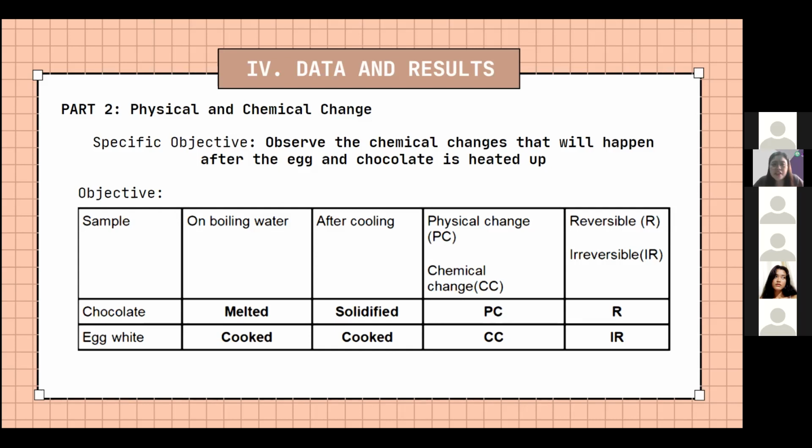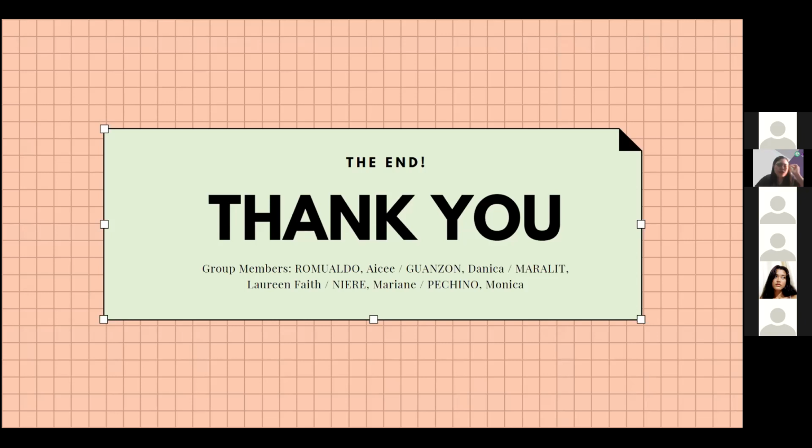But for the egg white, syempre kung ilalagay mo siya sa boiling water, maluluto siya. And from the liquid state niya, magiging solid siya. After cooling, it will remain solid. Hindi mo na siya mababalik sa kanyang original state. Therefore, this is correct. This is a chemical change. Because again, this will be irreversible. So yun yung kaibahan nila ni chocolate kapag isa-subject natin sila sa boiling. Okay? I think this is the last one, right? Tama ba? Okay, yeah, that's the last one. So let me show you the video now sa pag-operate natin sa Bunsen burner kung i-close o i-open natin yung ating air hole.